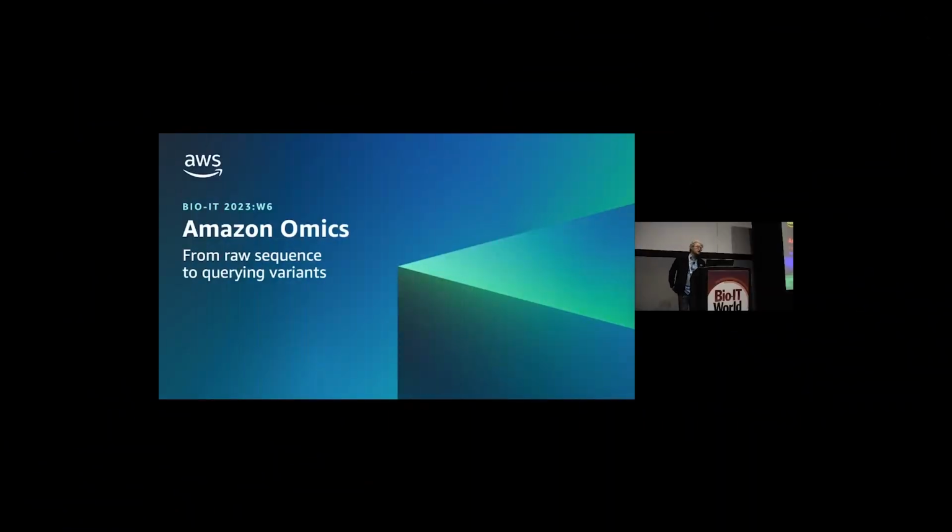My name is Lee. I'm a principal solutions architect with our Amazon Omics product team. I've been at Amazon for just over 5 years, and for almost the entirety of that time, I've been focusing on solutions in the genomics and life sciences space. Today, we're going to cover how to use one of our services, Amazon Omics, to go end-to-end from raw sequence all the way to querying variants.